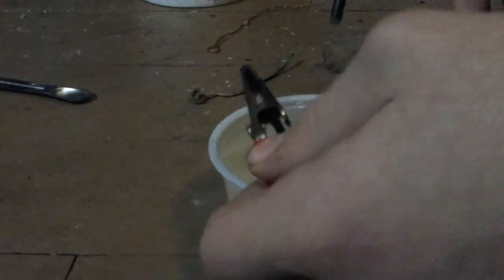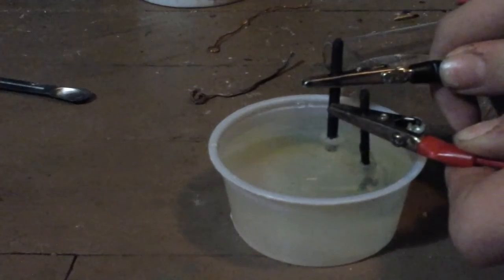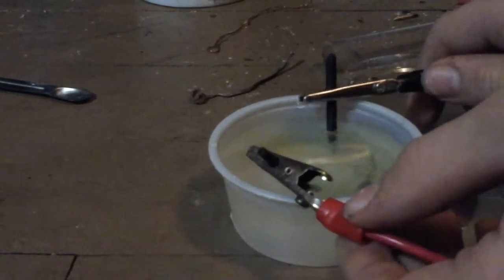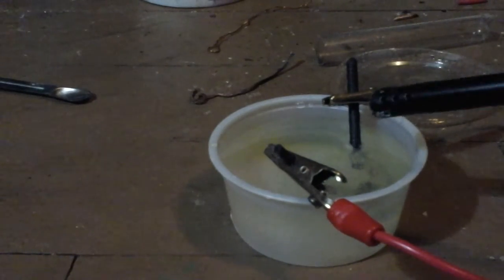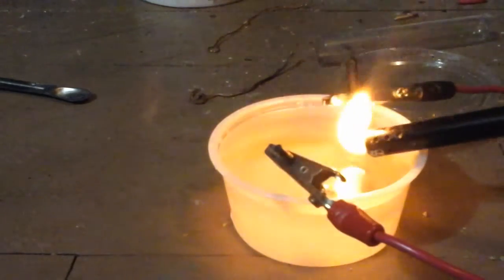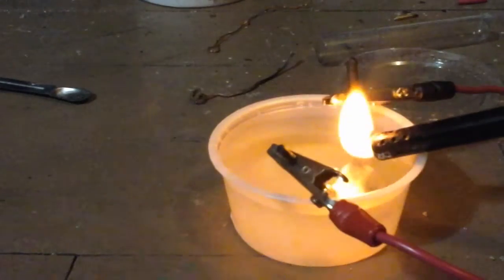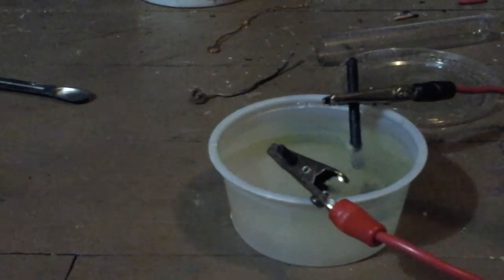Negative, positive — and then stick them both in. This side should be the hydrogen. Yeah, you can hear that little popping sound.